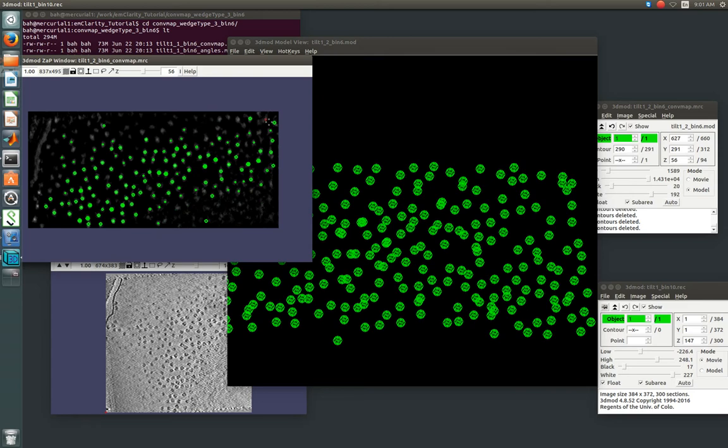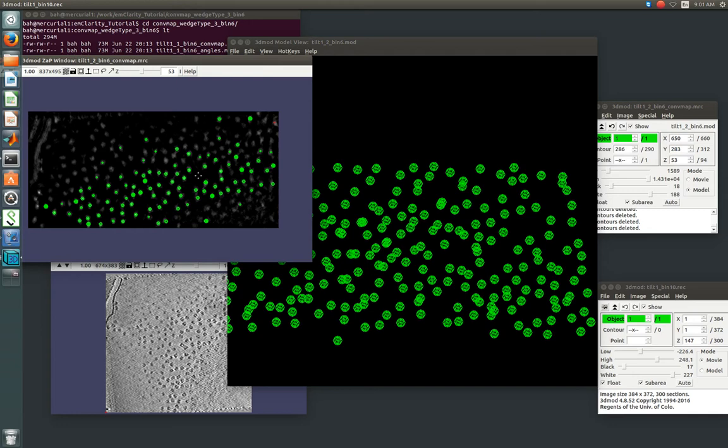And we get rid of these guys too. So as much as we want to keep as much real data as possible, it is also, in my opinion, better to lose a few potential good hits than to keep a real strong false density in there.